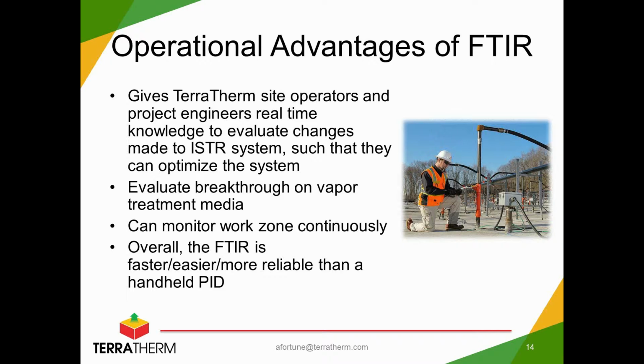handheld PID. The FTIR system was sent off for initial calibration with the vendor, and it's typical for those types of systems. They have very little drift, so it's very typical for those systems to just require a baseline or a zeroing and not necessarily a span calibration check on any kind of a regular basis.